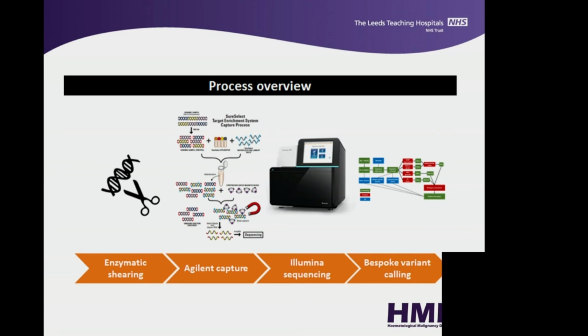The long-term future, and this is my last slide, is that we want to look at hybrid capture. We want to do a large haemonc panel, probably 300 genes. We've got proof of principle in this. We've worked with Philip Beer, who was at the Sanger and now works with us. He was the director of the 14MG. He had a very large panel, again using SureSelect hybrid capture. The difference between that panel and what we're hoping to do in Leeds is that we're not going to use Covaris. Covaris is a very expensive piece of machinery, very expensive to run on a routine basis, because each sample is £5 for a little tube before you even start.